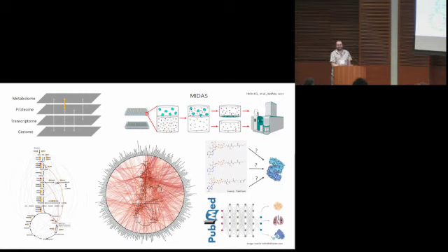Right. Yeah. So that's very difficult. I mean, this is an in vitro model where it's not going to perfectly replicate that scenario. Some things that Kevin, who has spearheaded the Midas project, has done is, because all these metabolites have different properties, we have to pool these metabolites in 4 different pools and run the experiment. And so what he's done is modulate the amounts of certain metabolites to see, do we still get the same enrichment results from that?